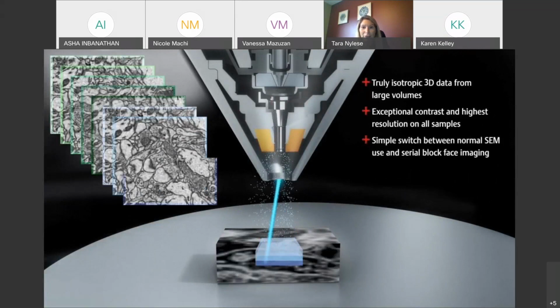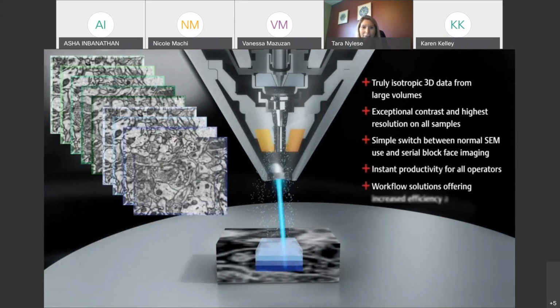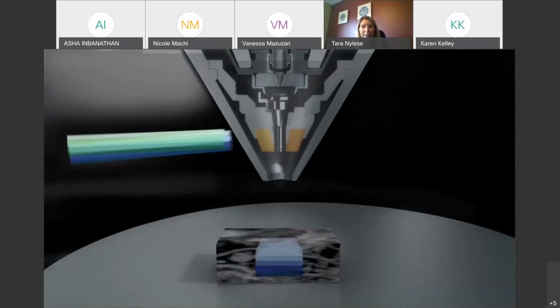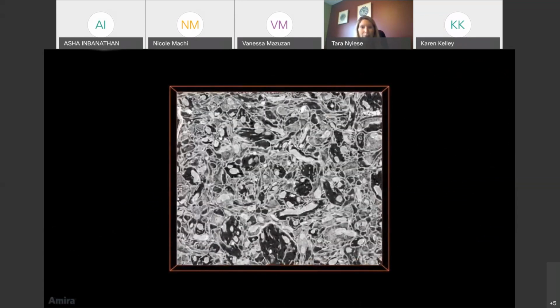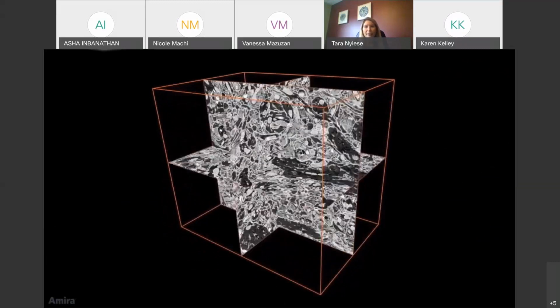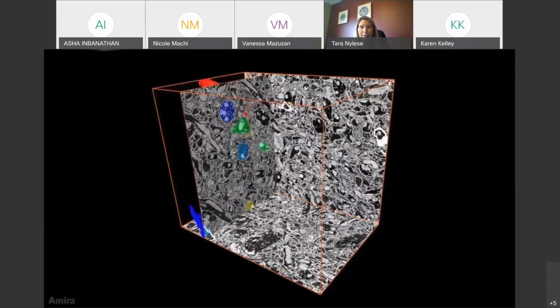Another layer is physically removed, and then that series of images using multi-energy deconvolution is collected and detected by the in-column Trinity T1 detector, which gives you a view of backscatter and contrast. And we do an inversion typically because of the heavy metal stain.